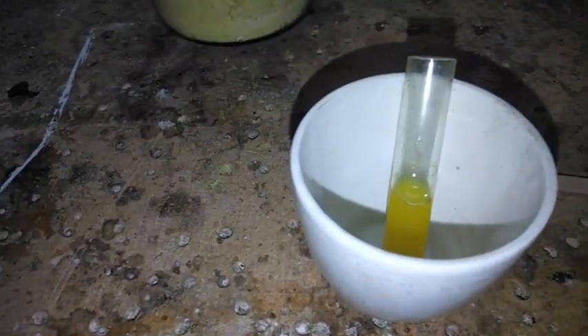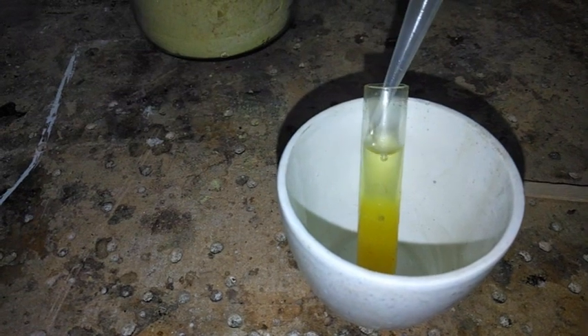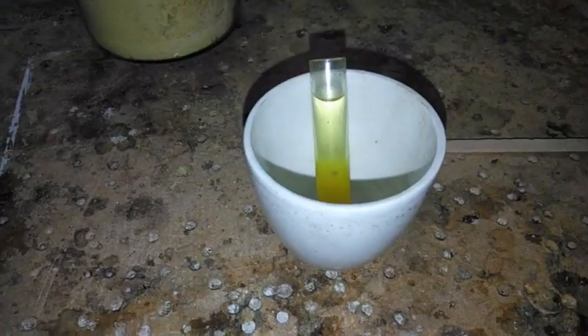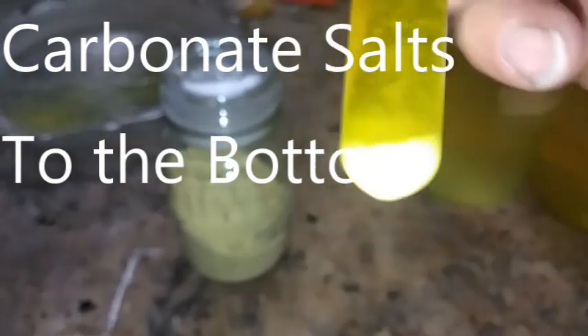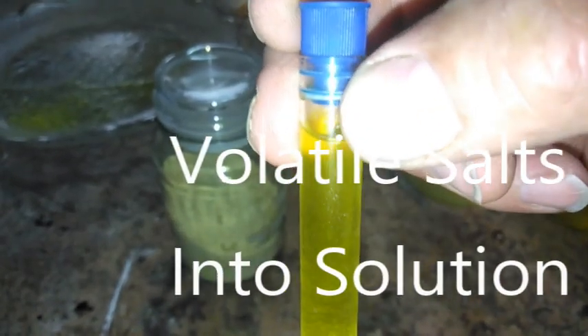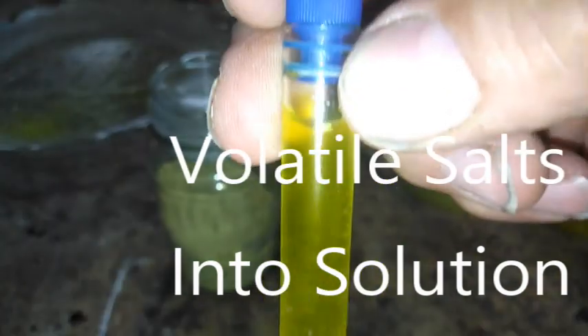I'm just going to add the ammonium hydroxide and that should sit on the top. There we go, that will do it. So all the salts you can see on the bottom are carbonate salts — potassium carbonate, sodium carbonate and other carbonates. And in our yellow solution is all the volatile salts. If we dehydrate that we should get a little bit of volatile salts.